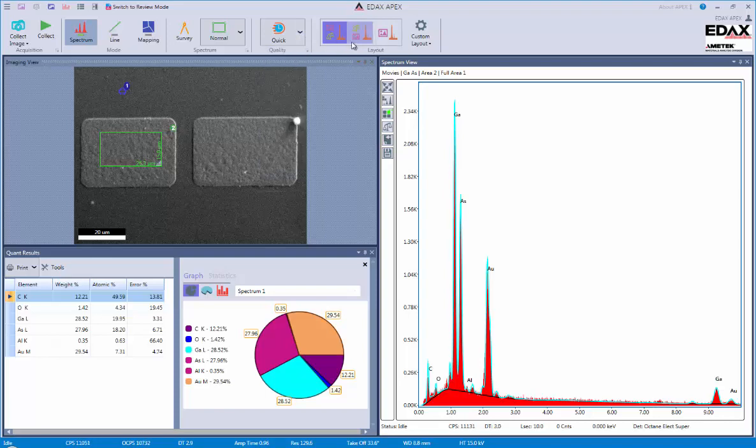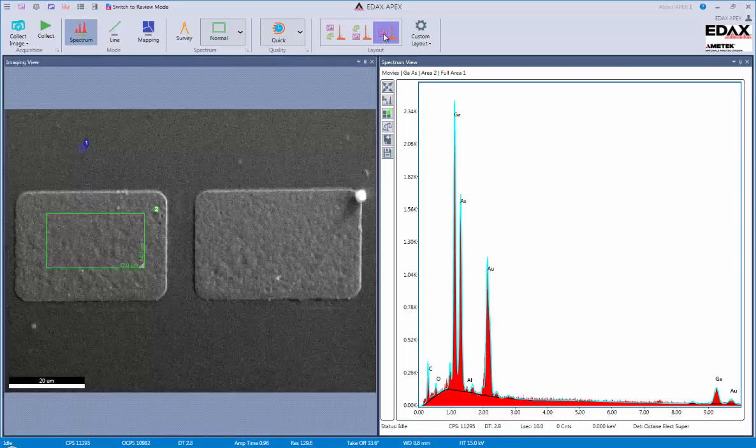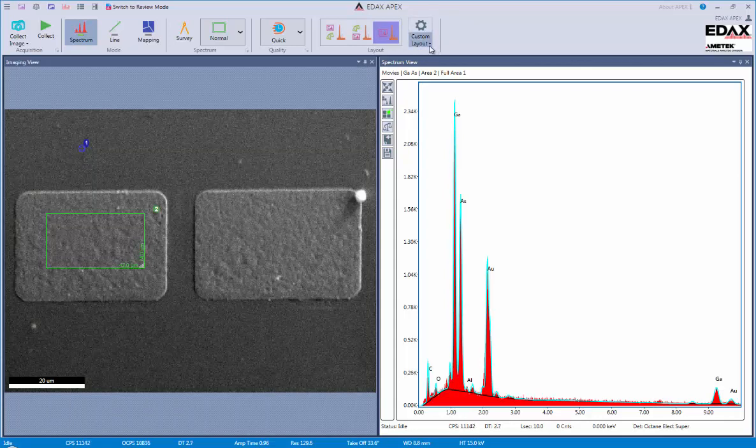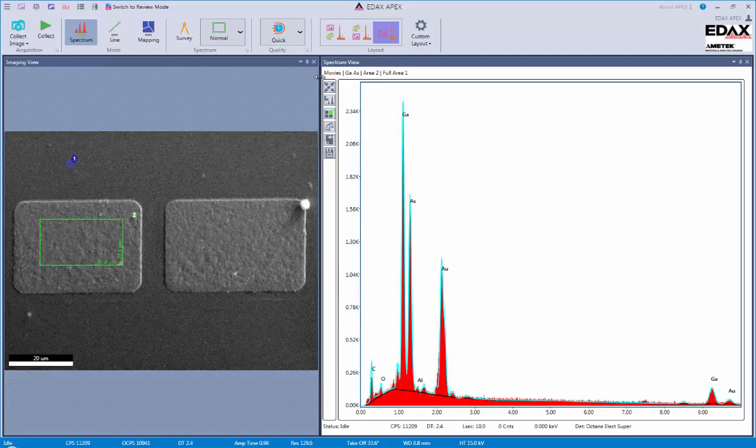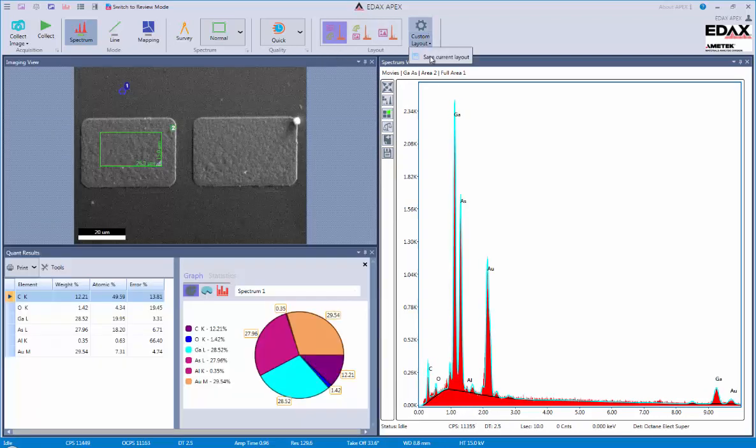Finally, the layout allows us to change how we view the data available to us. So, for example, the image and quant and spectrum or just the image and the spectrum. We also have custom layout options. So, you can customize the windows to exactly the size and shape and aspect ratio that you would like. And you could also save those layouts.